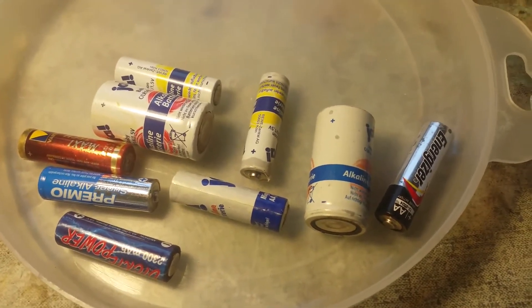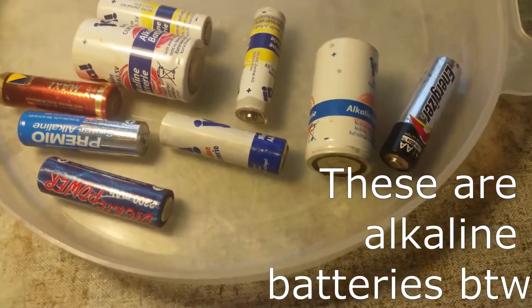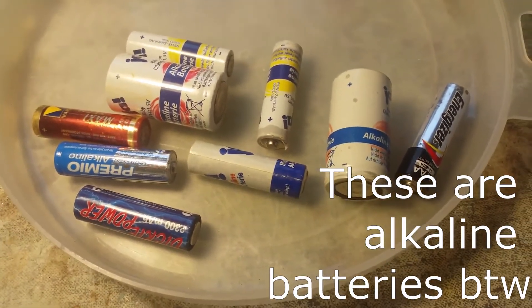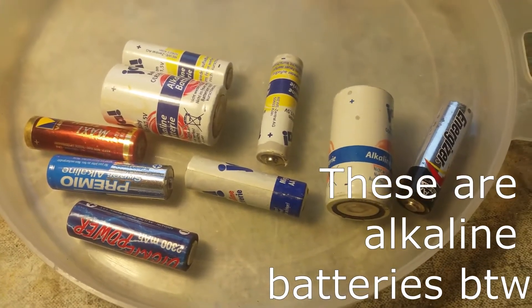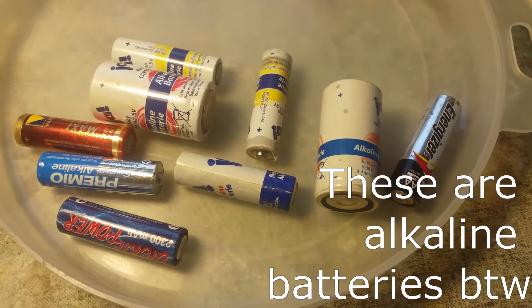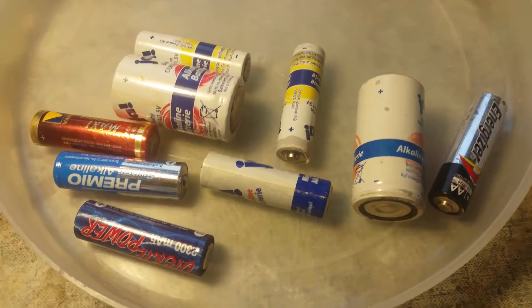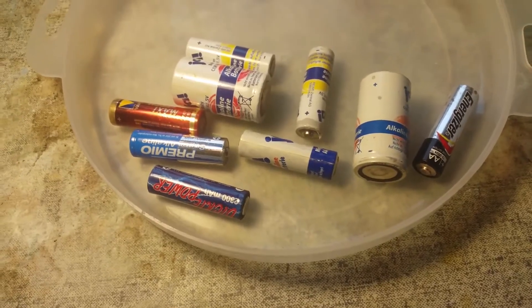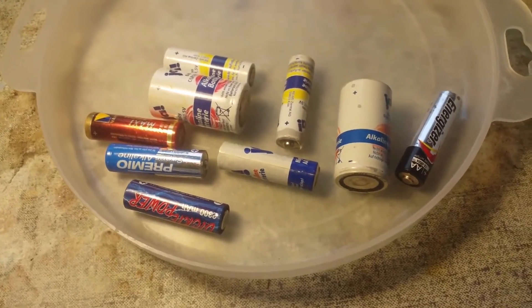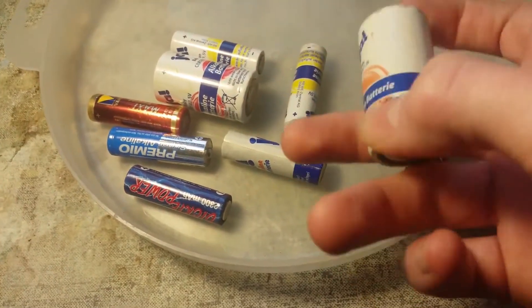Actually I'll be taking apart these batteries and getting out the manganese dioxide, and then turn it into manganese nitrate. I need the manganese nitrate for a future video where I will use it to make manganese dioxide electrodes for electrochemistry. So I'll just go ahead by taking these batteries apart and somehow getting the manganese dioxide out.